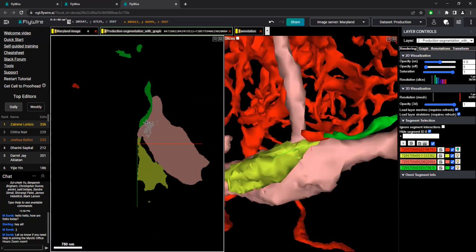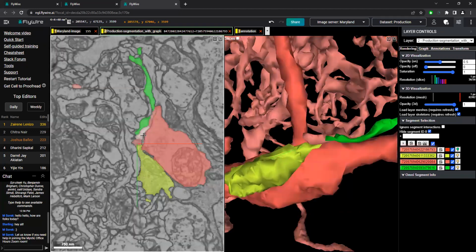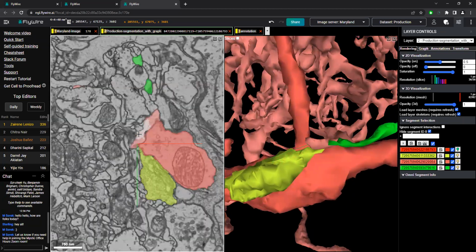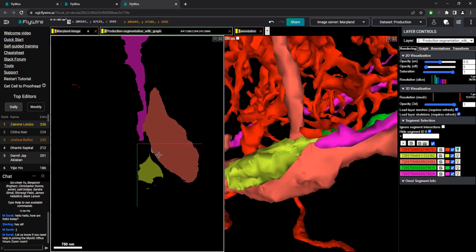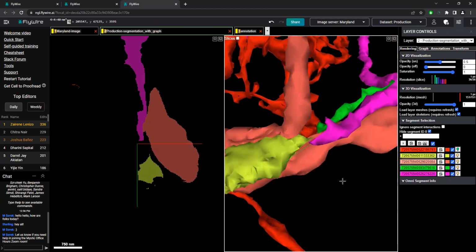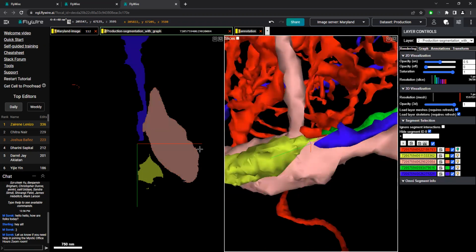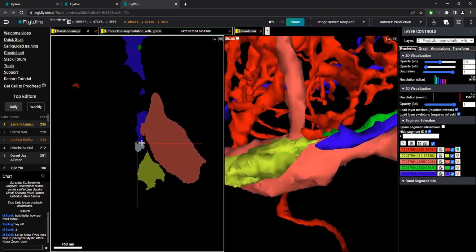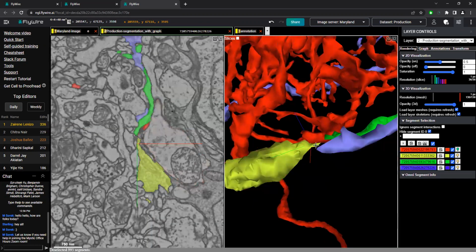Let's scroll here and hover over where we know this is the little nub part that I keep highlighting with my cursor, this little crescent piece. I'm going to go into the black slide and see, oh, maybe I should click this. Well, that's interesting. It goes down this way. Let's color it blue. We can see there's a little jaggedness here. So let's get rid of our red pieces.